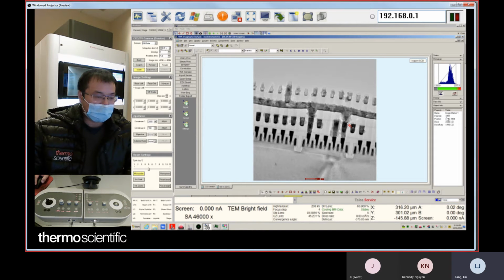Right now it's about 3,000, so it's about 4,000. You make sure you go over and find the brightest spot. That means the max count within the image is probably around 4,000. Then you can do a sample calculation.